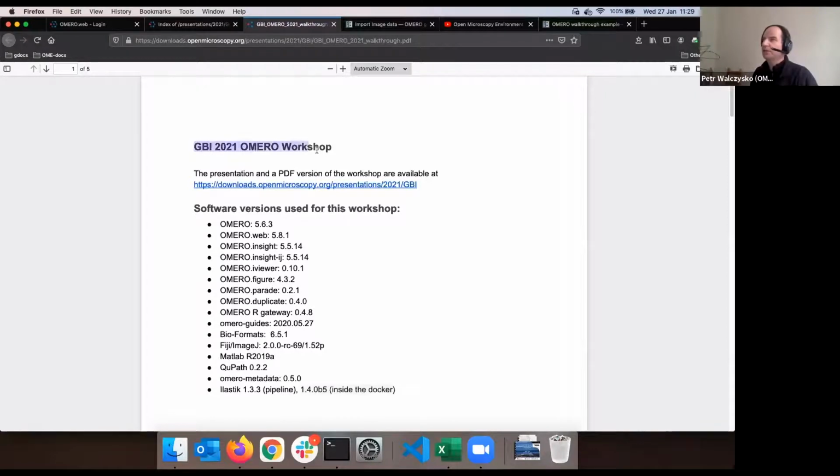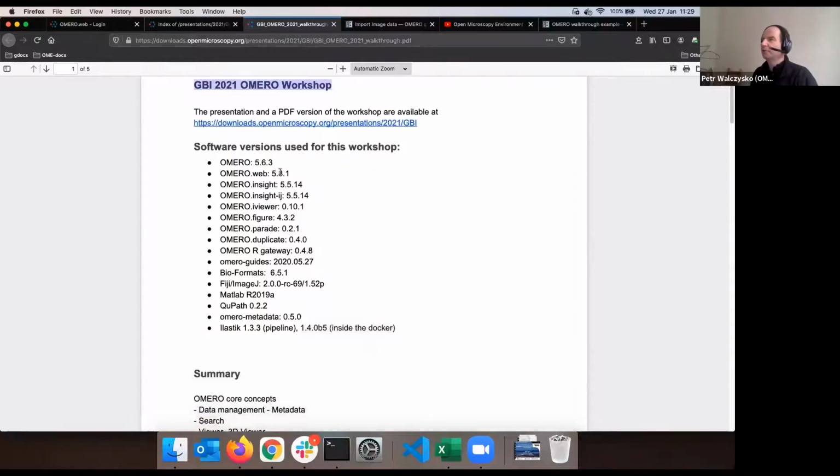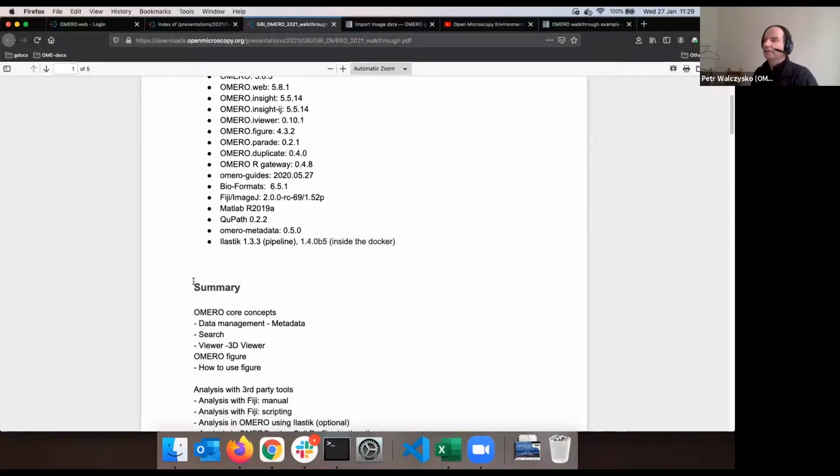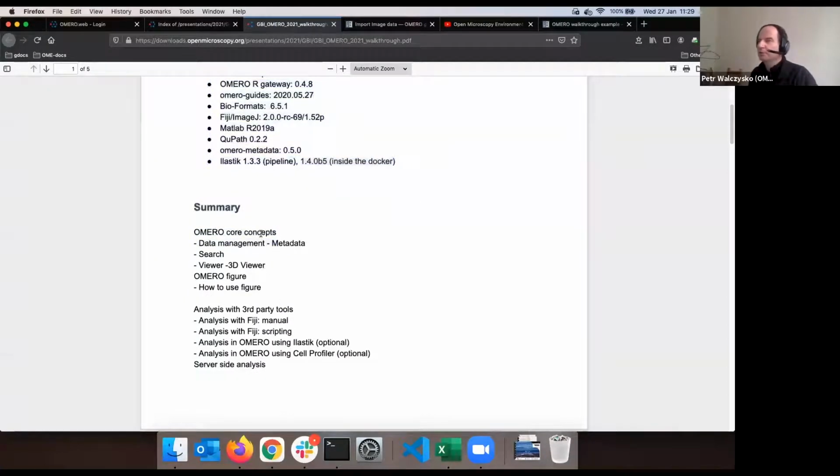Okay, it starts GBI 2021 Omero workshop. The presentation and PDF version of the workshop are available at, then there is a summary. So we will go through Omero core concepts, data management, and metadata. Okay, for that, we are now switching. I showed you a couple of slides on how to import data. We're discussing that. And now we want to switch to Omero Web. Why? Because Omero Web is our main client. That's where we are channeling our efforts, and that's where we are putting new features. That's where all the nice plugins are.